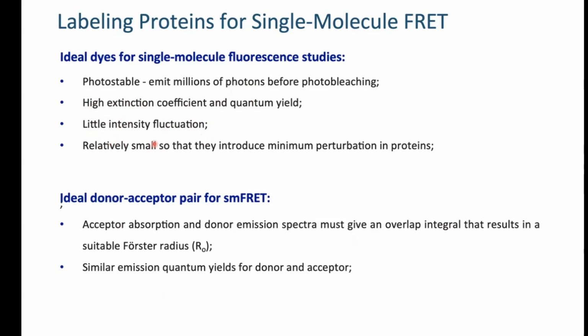It should be relatively small. Also, of course, have some linker. The fluorophore itself should not interact with the protein that you are studying, and should not introduce any effect in terms of function and also overall conformation. So you need a lot of controls when you are preparing your protein.